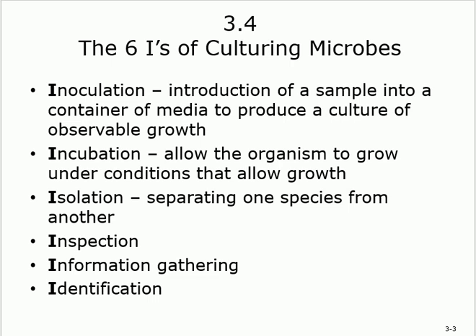Basically, inoculation means to inoculate something, meaning to get that sample of organism and put it into a medium. Okay, this is inoculate, so introduce it into a culture. Incubation, on the other hand, is when you incubate something, like we say that the baby is premature and we put it in the incubator, right?